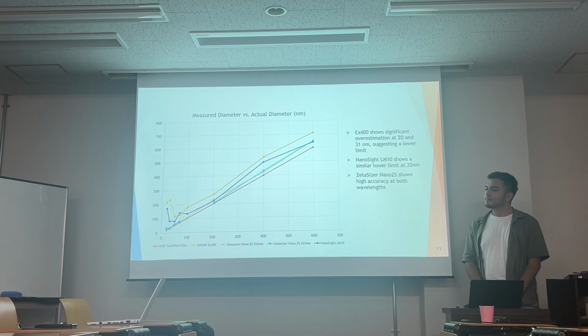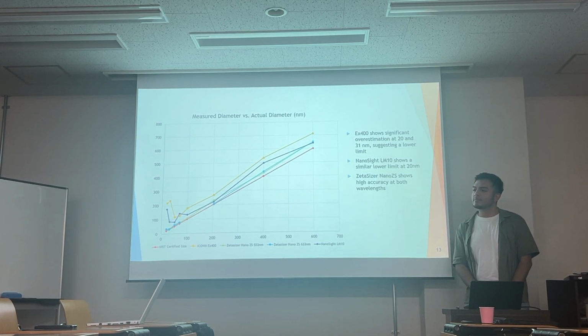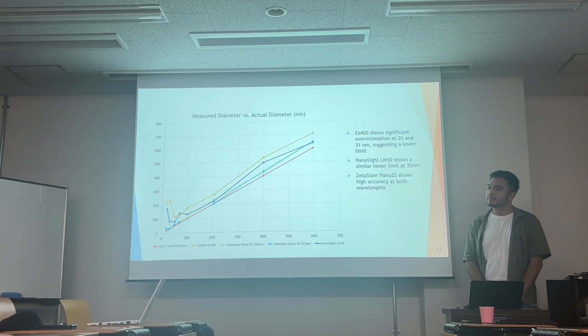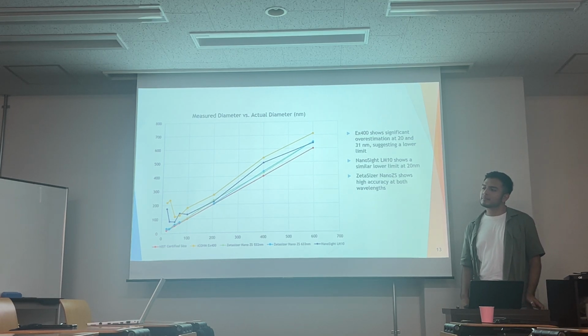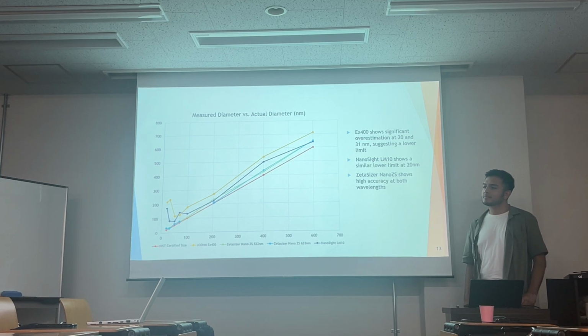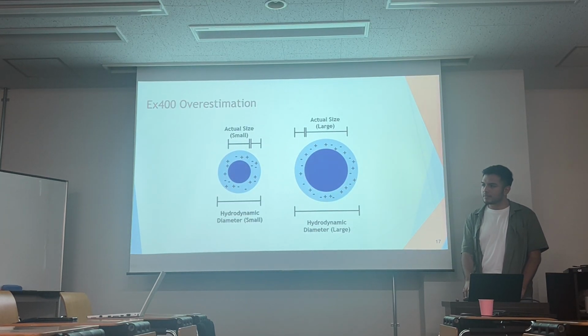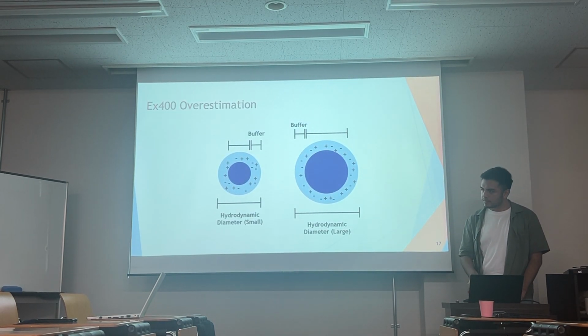So you try to explain the difference between the true diameter and hydrodynamic diameters by the difference between the actual and hydrodynamic diameters. Yes.